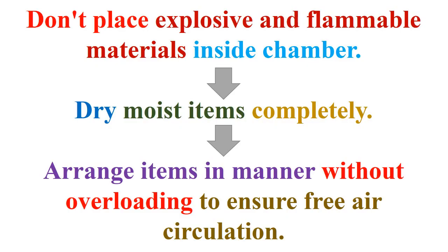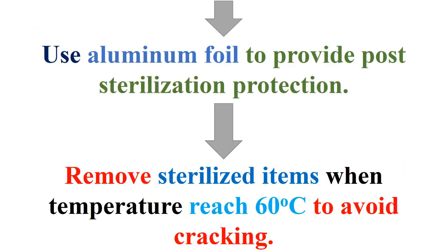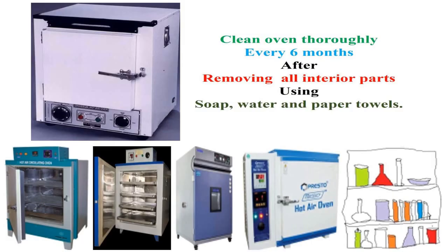And when working with the hot air oven, don't place explosive and flammable materials inside the chamber. Then dry moist items completely, and arrange them without overloading, to ensure free air circulation. After that, use aluminum foil to provide post-sterilization protection, and remove sterilized items when the temperature reaches 60 degrees Celsius, to avoid cracking. Finally, clean the oven thoroughly every 6 months, using soap, water, and paper towels, after removing all interior parts.